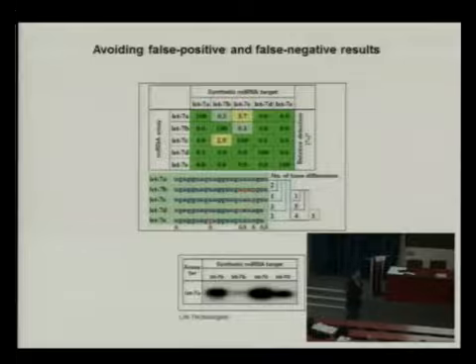Now there are other specific pitfalls in the measurement of microRNAs. One pitfall is that due to the short size, the microRNAs are very similar to each other, and they sometimes only differ by one nucleotide or so, which you can see here in the case of the LET7A and the LET7C microRNA. So if you use hybridization-based methods, you will not only detect the LET7A, but also at the same amount LET7C.